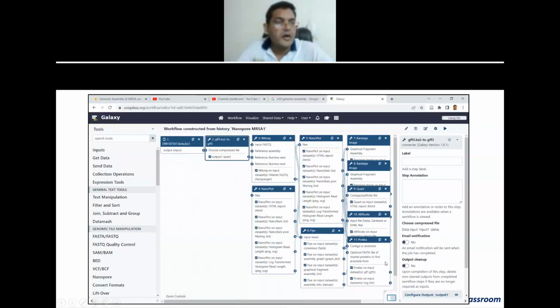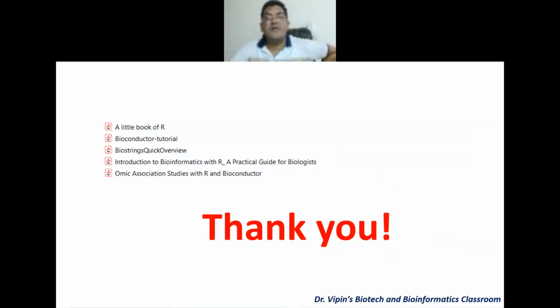And likewise, when we do hard coding, we do it this way again. We make pipelines so that the output of one is the input for the other. You may have to change formats a little bit here and there. So those are special wrappers that we write to ensure that the file formats change and it is easy. So this is where we are. We are done with this for now.